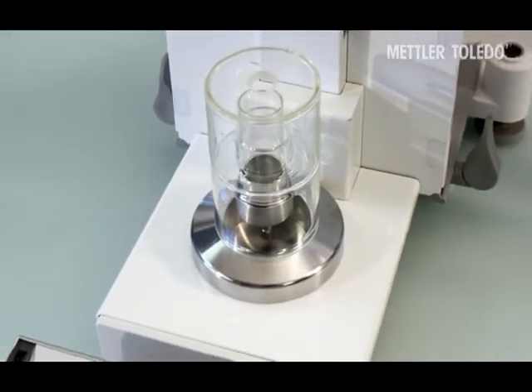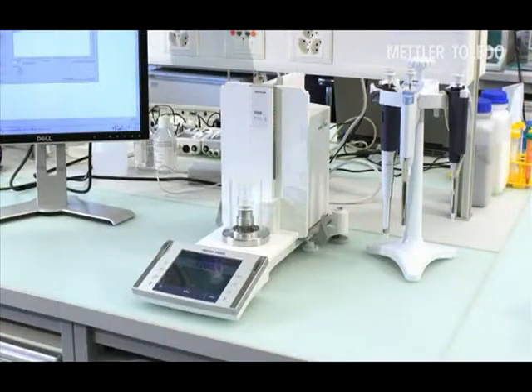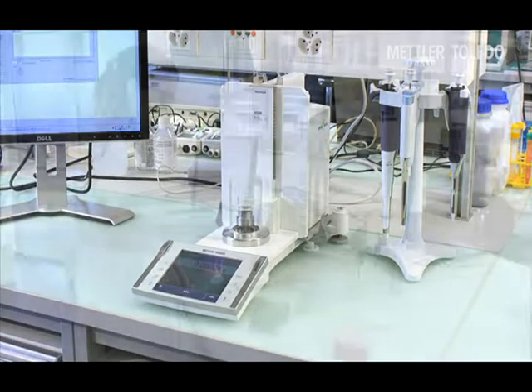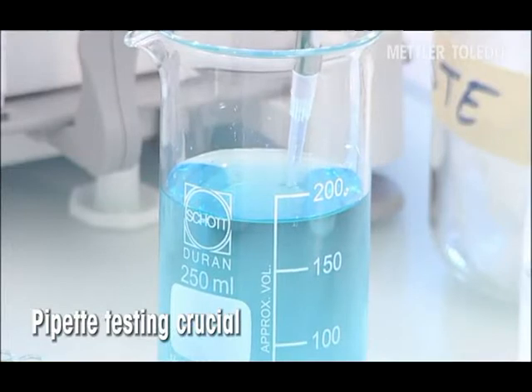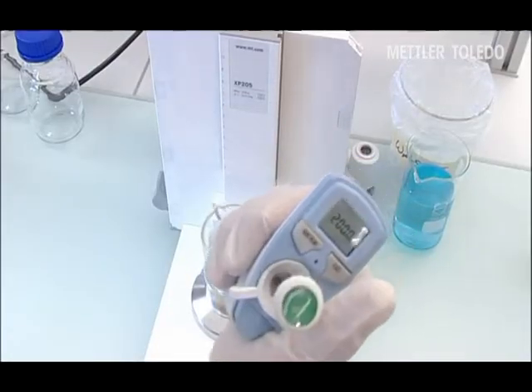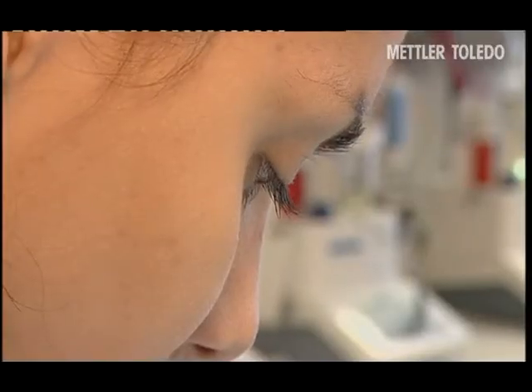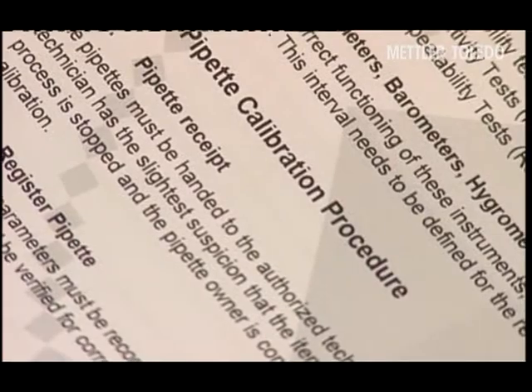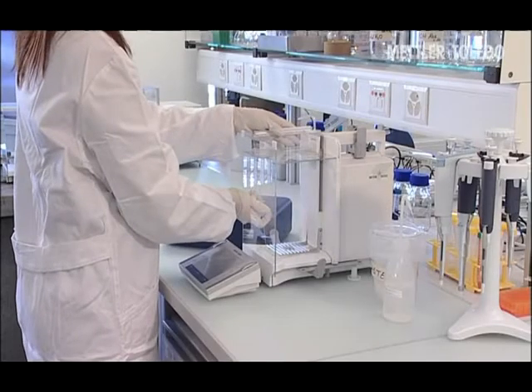Mettler Toledo's Evaporation Traps facilitate accurate gravimetrical testing of your pipettes. The routine testing of pipettes is crucial to ensure the reliability and repeatability of data, especially in the most critical applications. In most laboratories, a standard operating procedure is in place to enforce pipette checking.